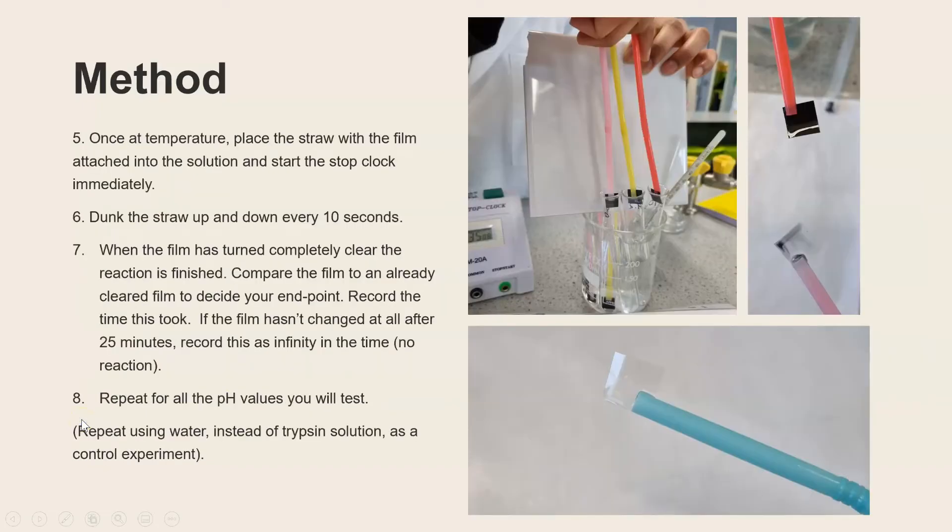So the next bit, once we've left it for five minutes and the solution is at the temperature, we'll then place the straw which has the film attached into the test tube and at that point exactly you need to start the stop clock. We'll then dunk the straw in and out of the solution every 10 seconds and when we're taking it out we're checking to have a look at the film.